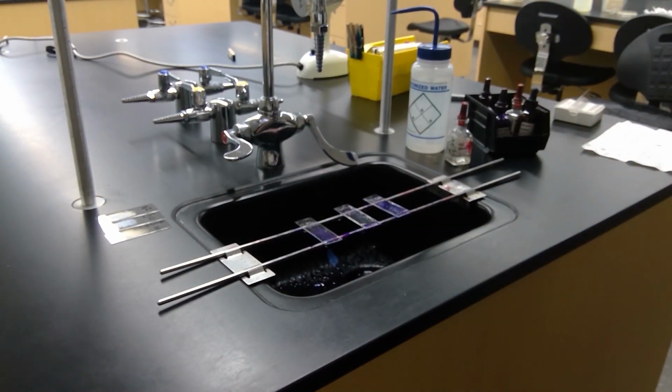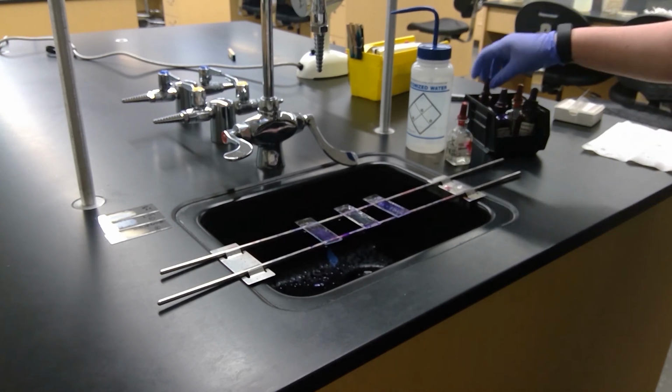We're at step 11. Carefully add safranin to cover the smear and let stand for 45 seconds.